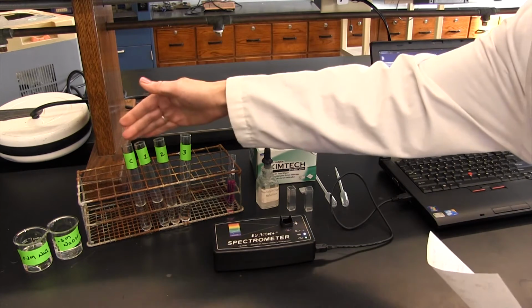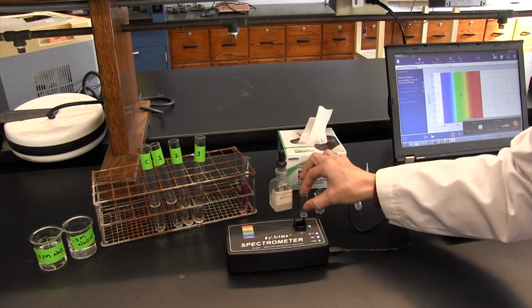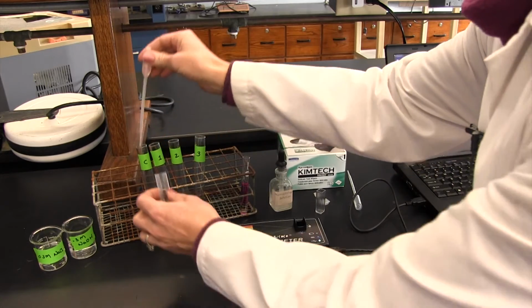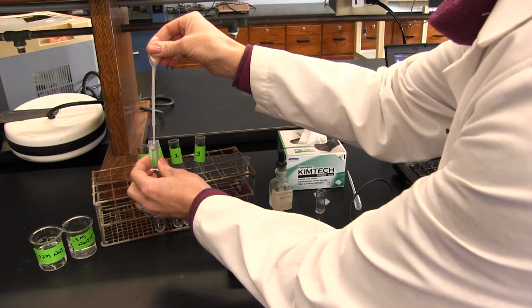As you can see, I've already made up all of the samples as described in the procedure. The first thing that we need to do is calibrate our spectrometer. So to do that, we're going to get some of our calibration solution, marked C, and we're going to fill our cuvette till it's about 2/3 to 3/4 full.